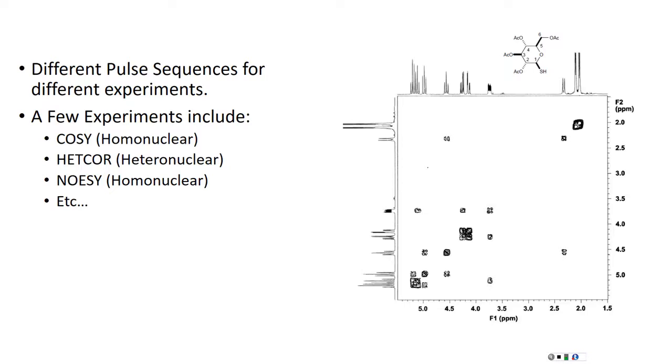So, for example, if it's between 0 and 1.5 ppm, generally that is the methyl group, or methyl groups which are connected to nothing else, or the hydrogen is connected just to a carbon in the methyl group. And then the more electronegative the environment gets, you get further and further, what they call downfield. And so then you have charts which say if it's in this range, then it's probably connected to something else. So for example, things way up here above, I think 7 ppm are connected to nitrogen, hydrogens, etc. And then in this range, a bunch of different sp2 hybridized things and ethers and esters, really connected to an oxygen that isn't an alcohol.